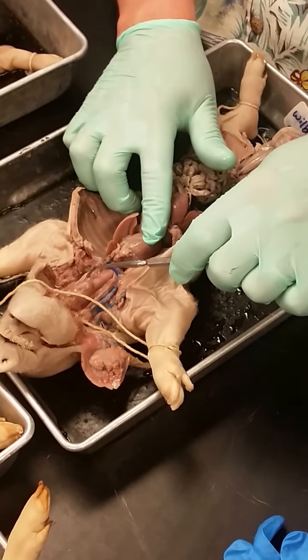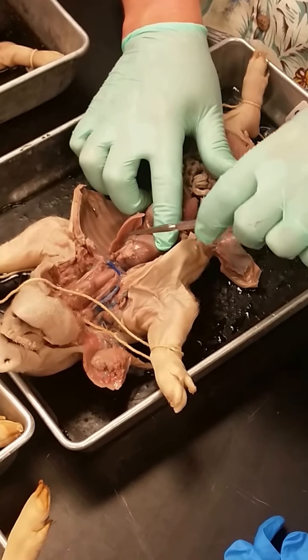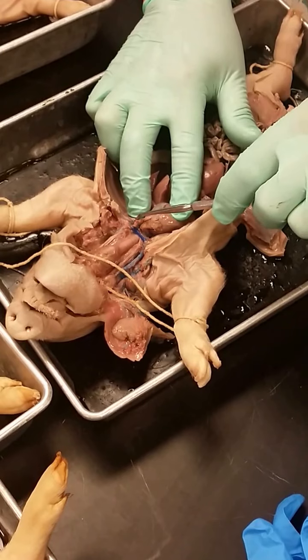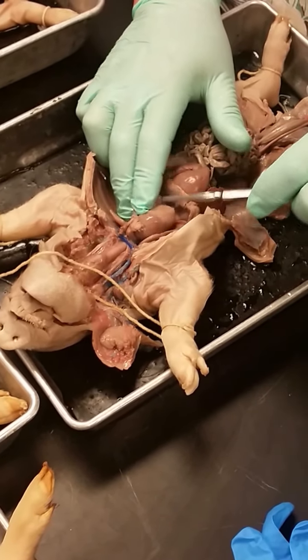And sometimes you can actually see the vagus coming down and innervating the heart. I've actually seen little fibers. In fact, right there, you can see a fiber coming in. See that? So there's a nerve fiber coming into the heart.